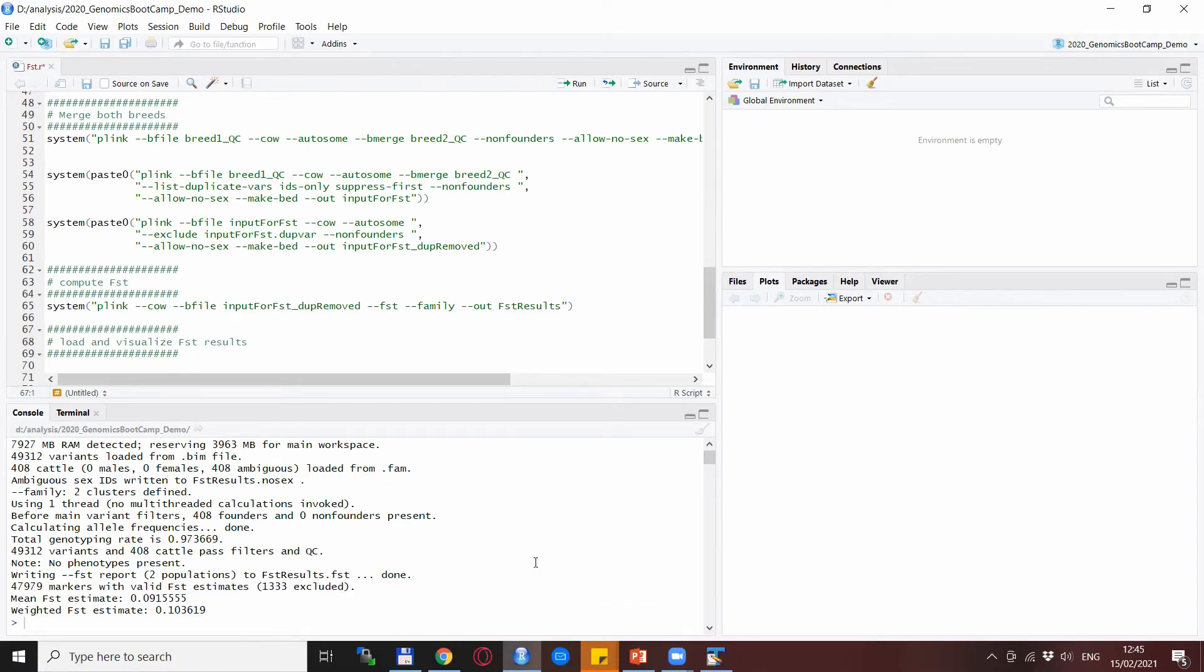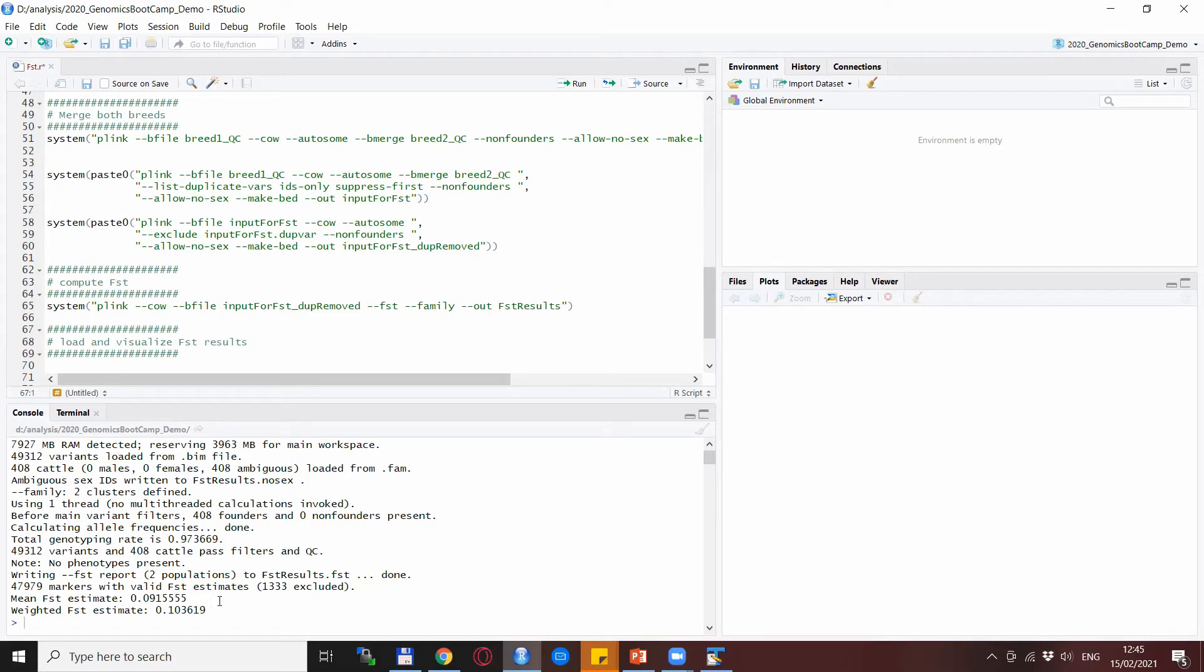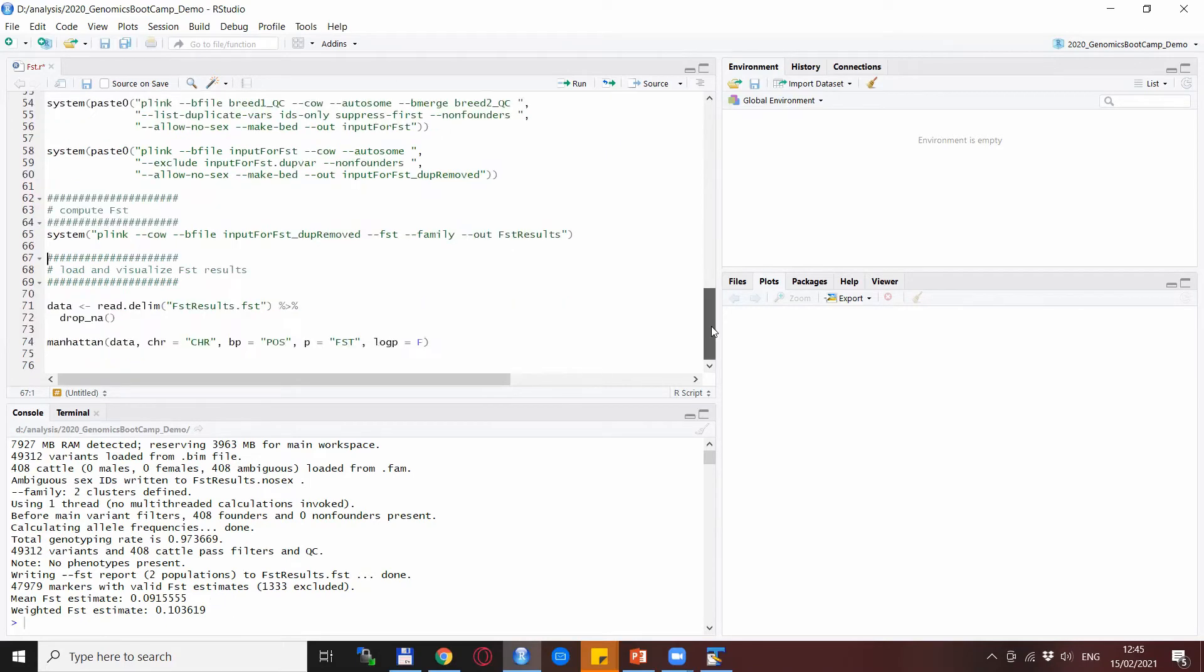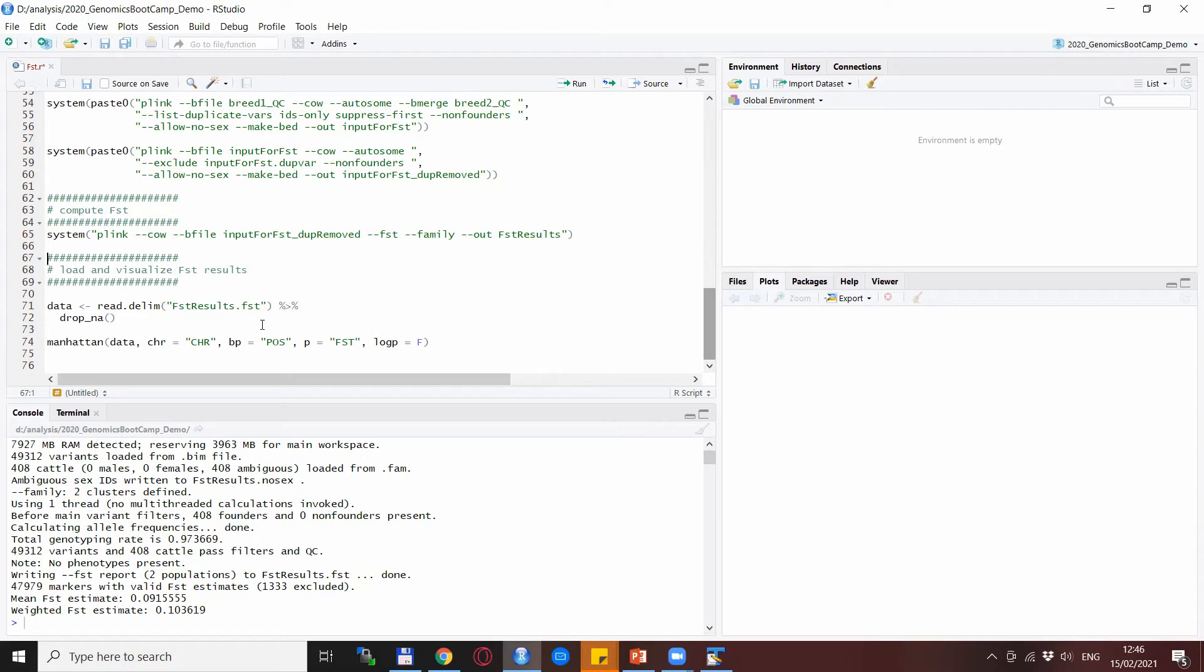After running the FST computations, you see that the mean FST between the two breeds is about 0.09, and the weighted estimate is also quite similar, about 0.10. But of course what we want to see—the summary data is nice, but the SNP-wise visualization is even nicer—so we actually load the data into R.